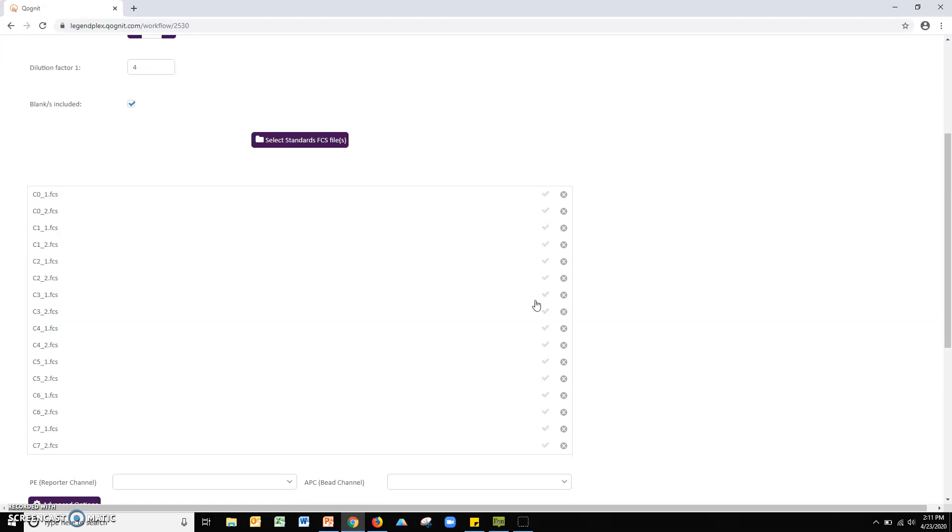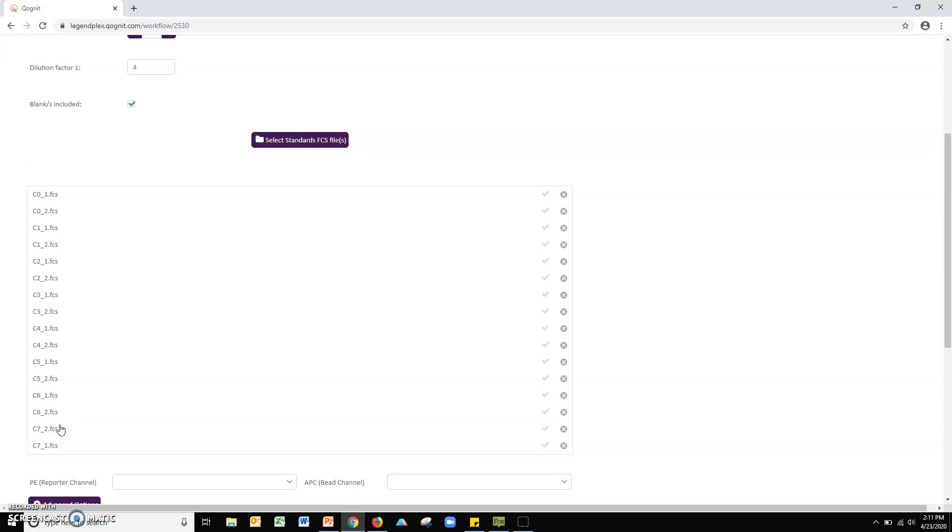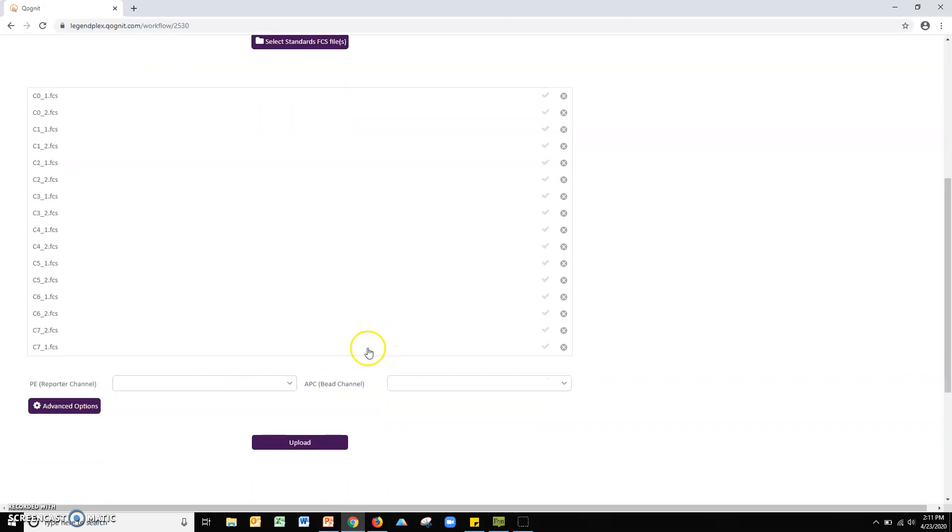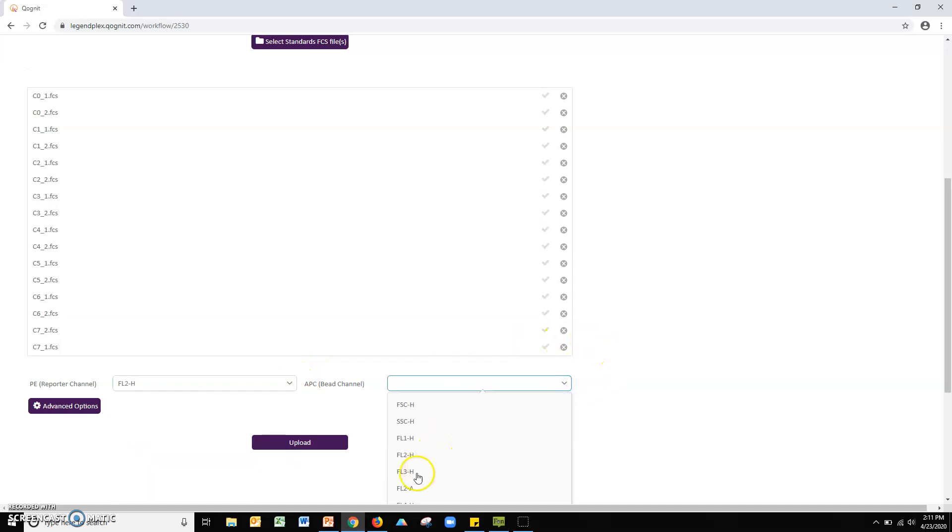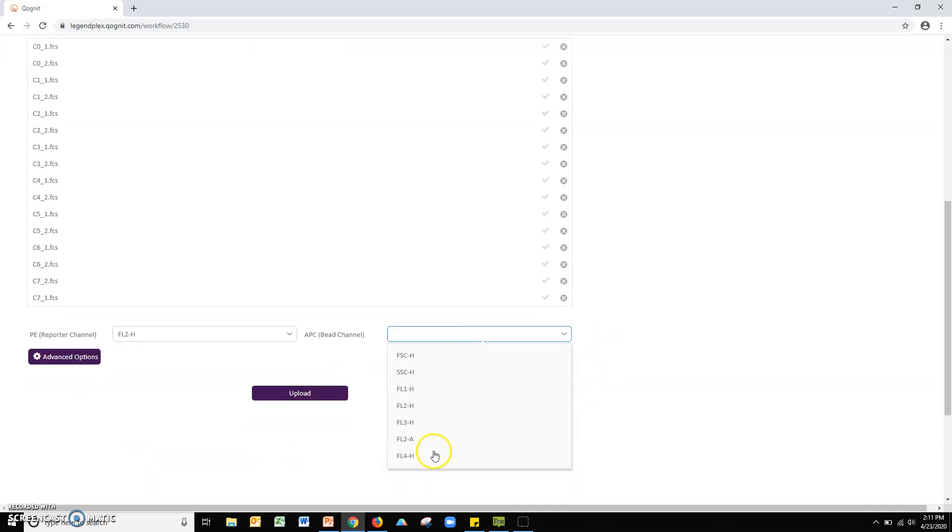Ensure that the files are ordered in increasing concentration going down the file list with C0 at the top and C7 at the bottom. Adjust the file order if necessary by clicking and dragging files into the appropriate order. Select both the PE reporter channel and the APC-B channel from the pull-down menus to match your flow cytometer settings. Click the purple upload button to upload your standard curve files to the cloud server.